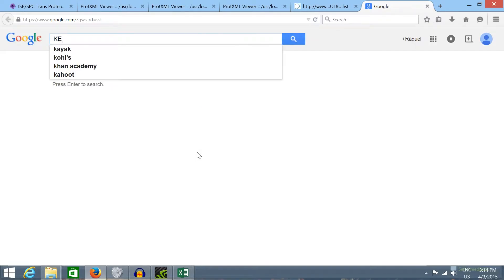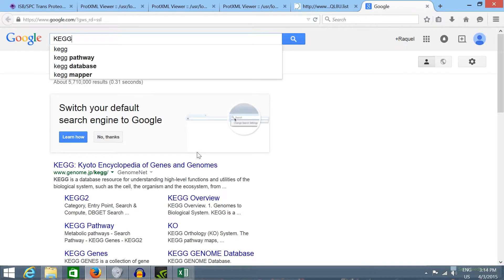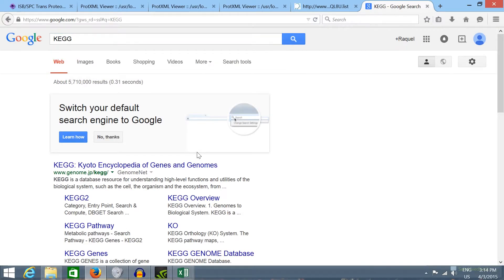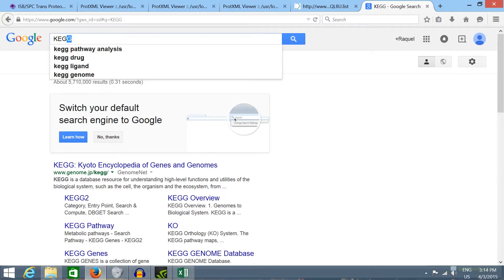In Google I'm going to write KEGG, K-E-G-G. This is one of the most comprehensive metabolic pathways databases.